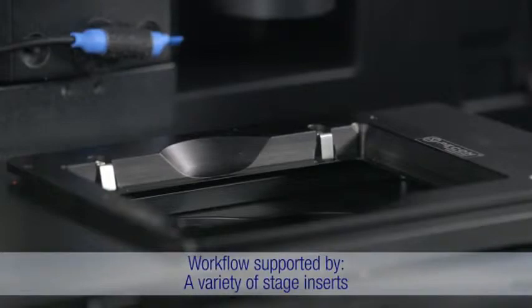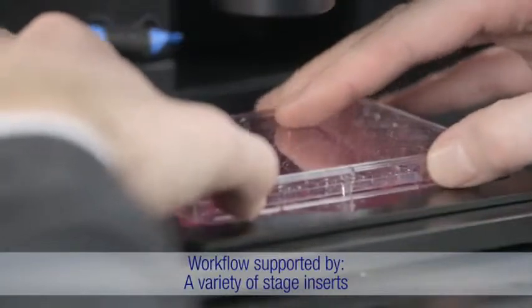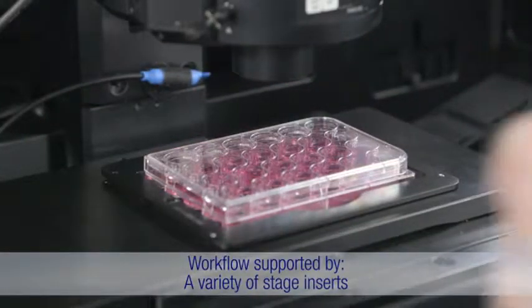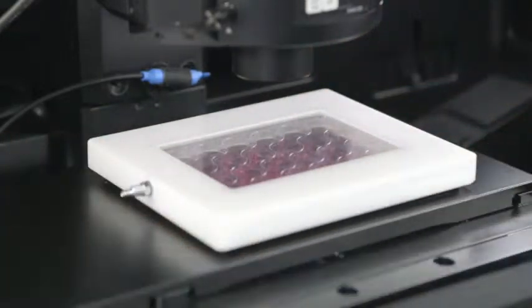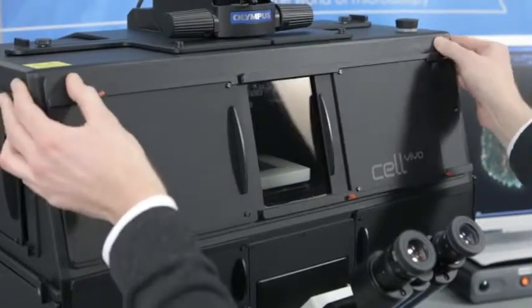Cell Vivo is also compatible with a diverse range of cell culture vessels, from different Petri dishes and glass slides to multi-well plates, owing to the variety of different inserts available. With such flexibility, you can easily optimize the system for each experimental setup.